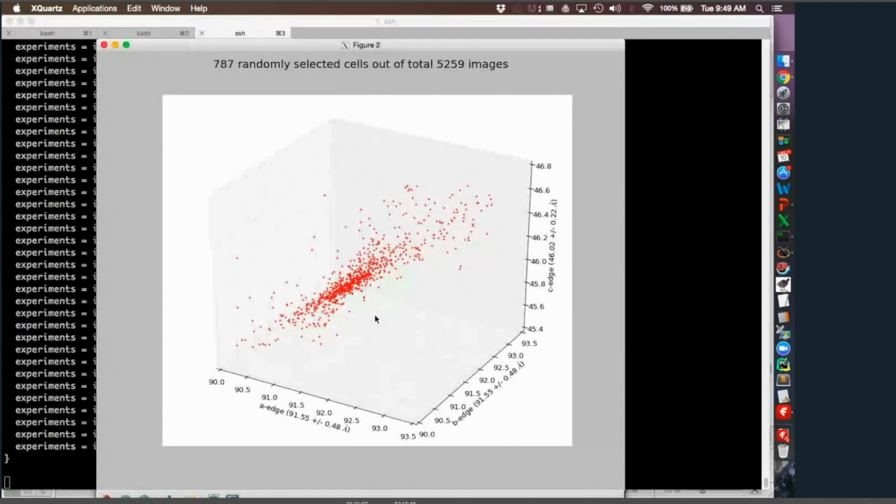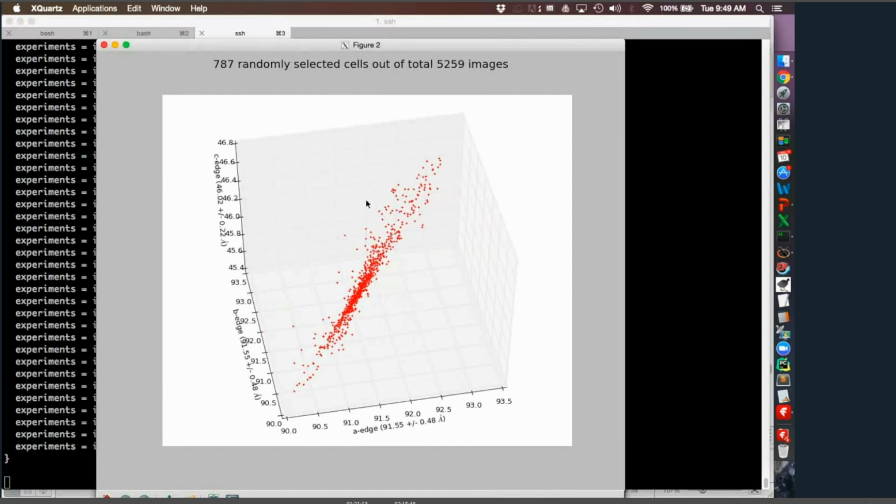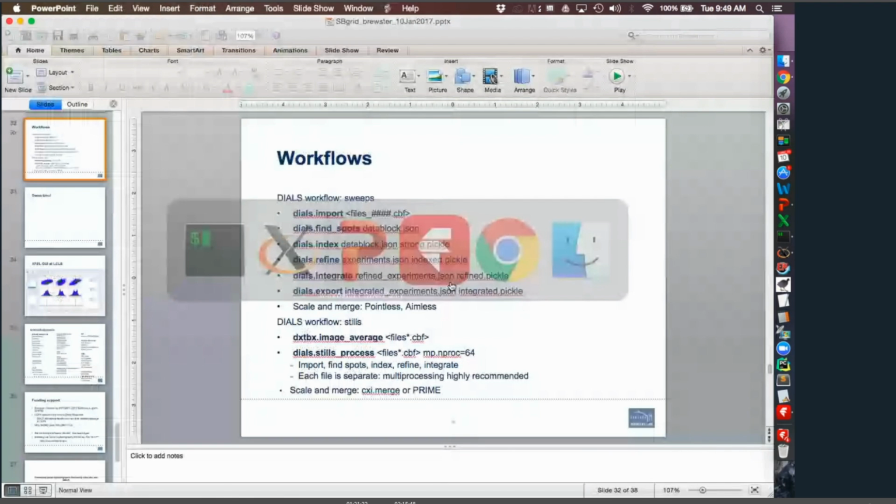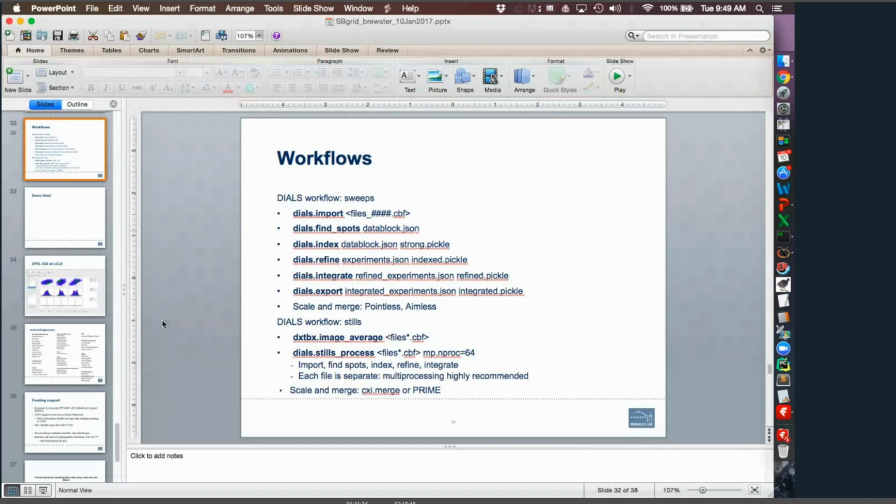And then this plot is a three-dimensional cloud. Over X windows, it's a bit slow to operate, but if there are clusters, you can see the different clusters appear very nicely in this cloud. Okay, so that's the demo there.